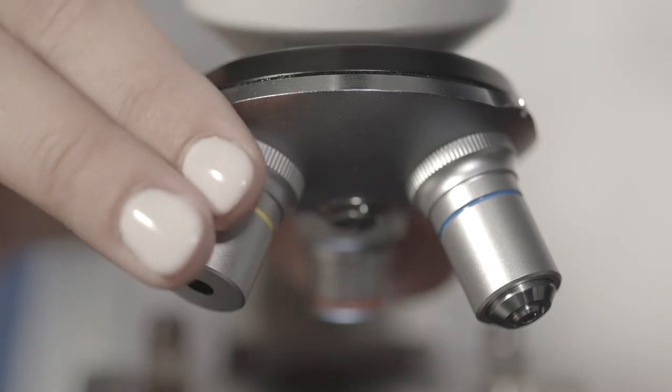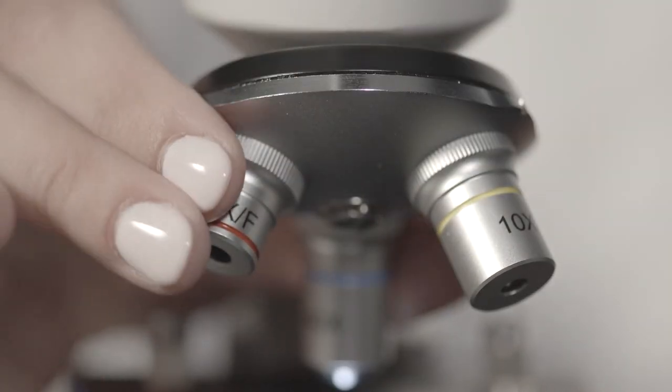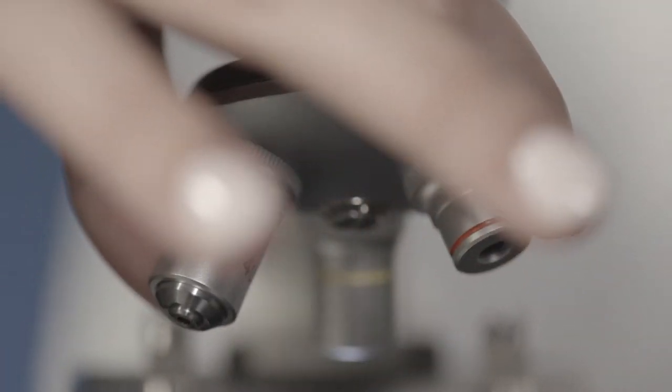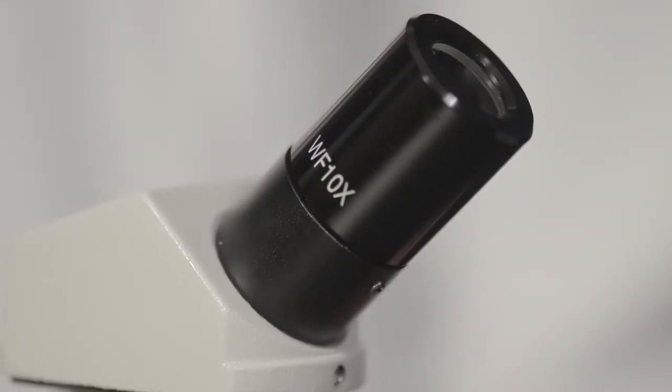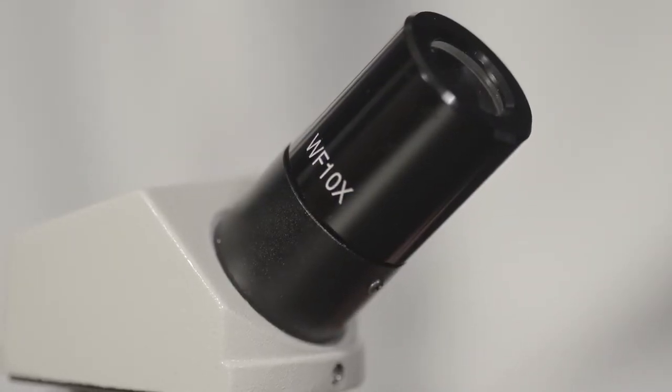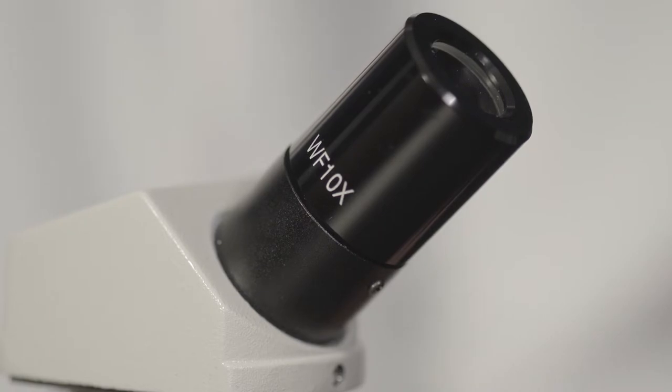These microscopes feature 4x, 10x, and 40x objectives mounted on a rotatable nosepiece. These objectives, when combined with the 10x eyepiece, will provide 40, 100, and 400x magnification levels.